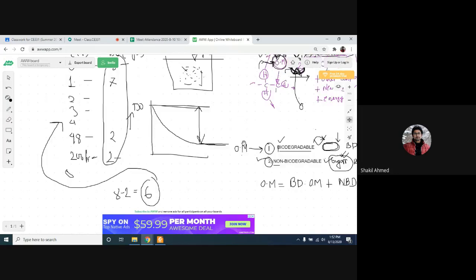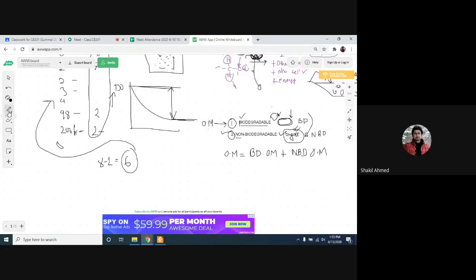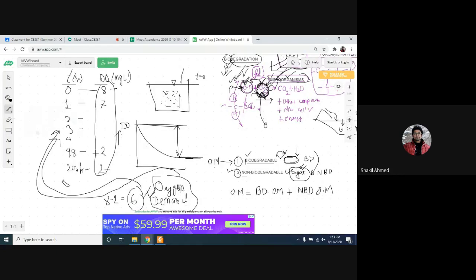Am I right or wrong? Right, sir. That means this was the demand of oxygen. So this oxygen demand is actually telling you how much organic matter was present in your water.